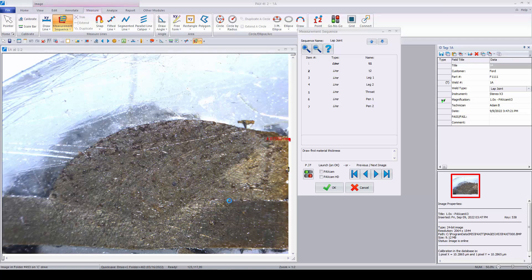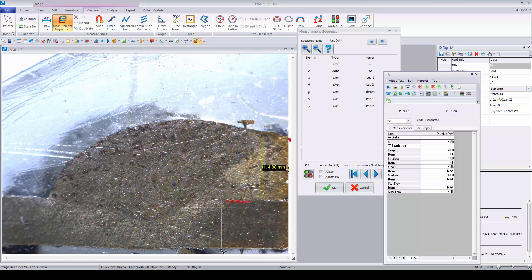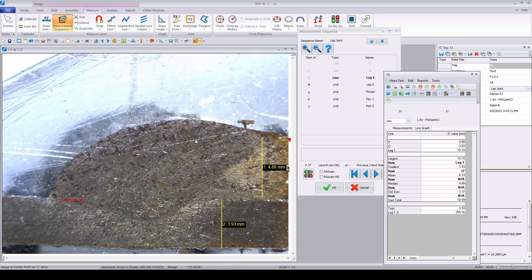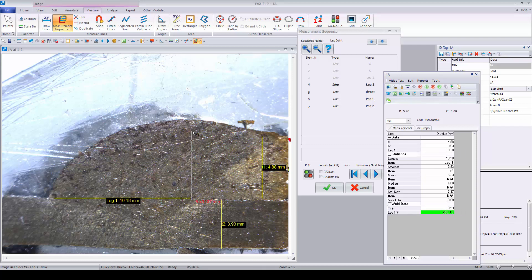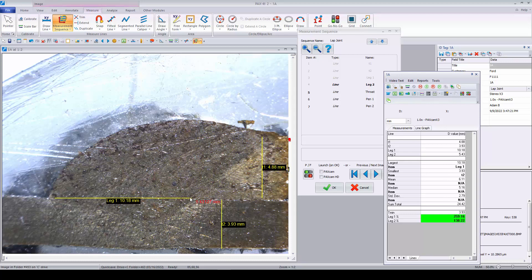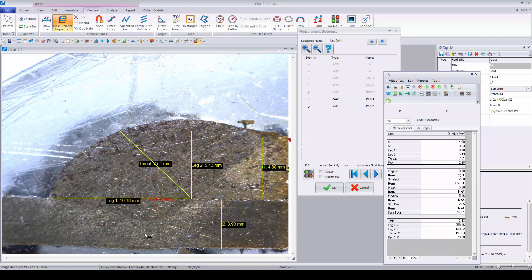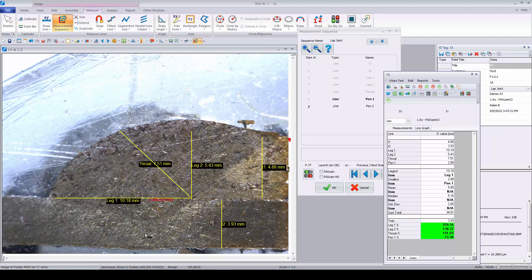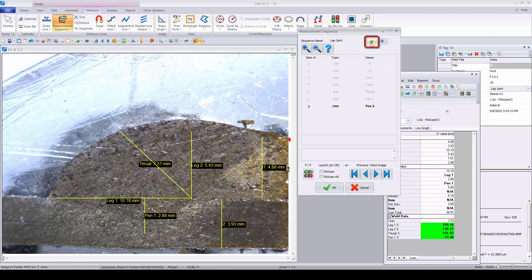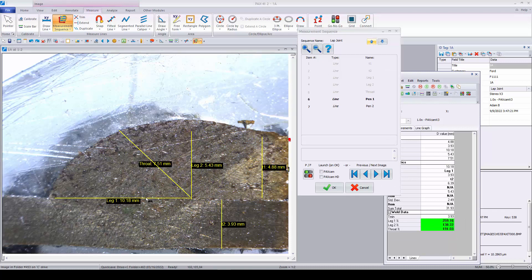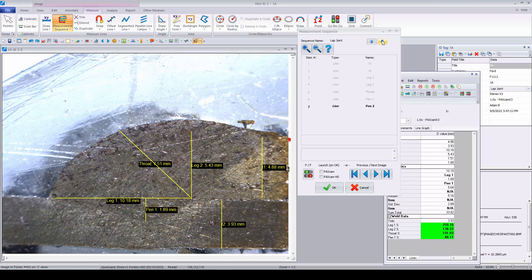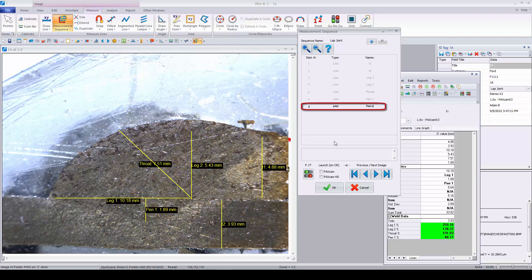Once loaded, the sequence appears in a dialog box to identify the measurements being made. Paxit switches between the appropriate measurement tools for the user, eliminating the time otherwise spent selecting tools in the ribbon. Measurements may be undone, redrawn, or skipped altogether if not applicable to the current sample.